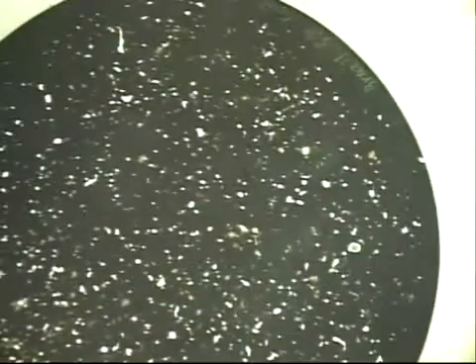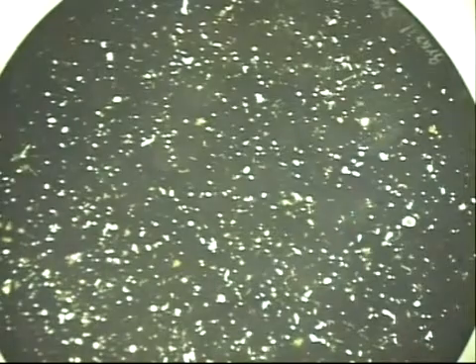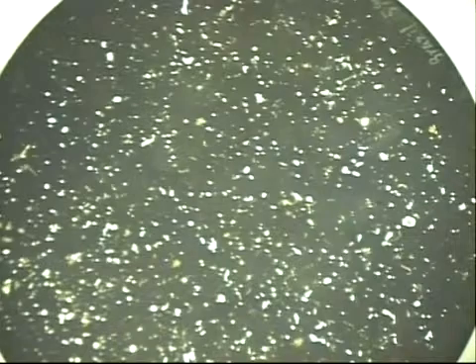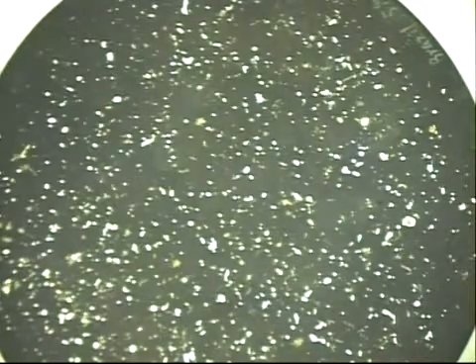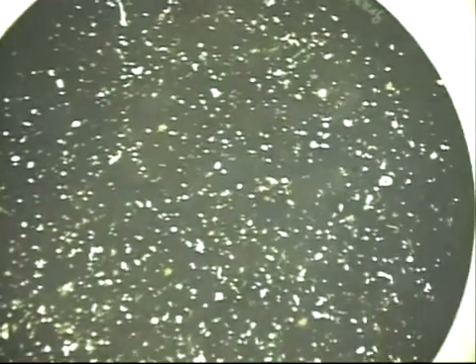The process, as I mentioned during the lecture series, also produces a black hand sheet, which you see here. Against a black background, that's not too clear. I'll move it over against the white, but you can see now it is black and white. The white portion is the Stickies. You can perhaps see the brown, maybe not so good.